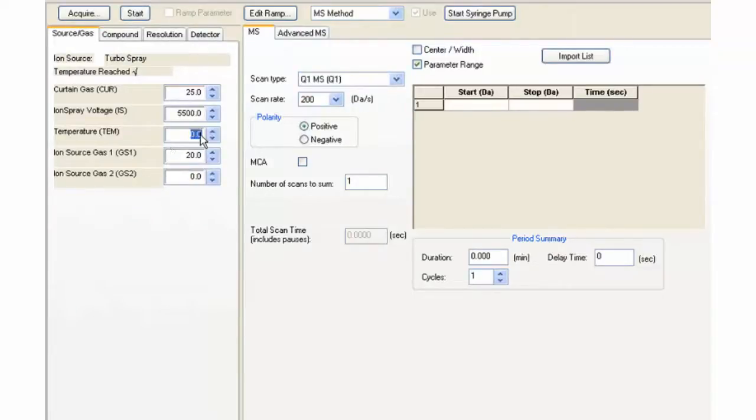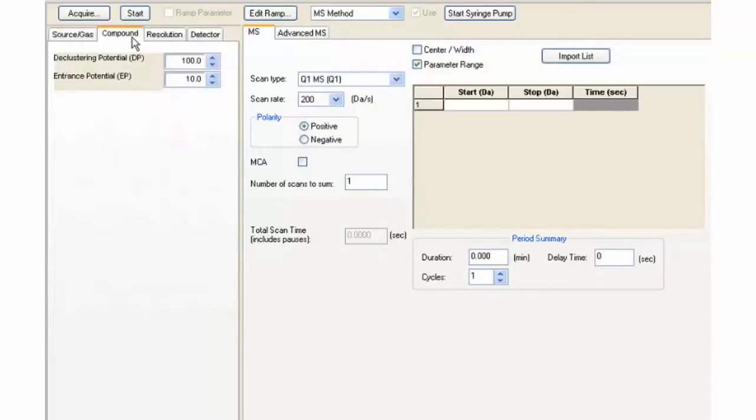Next, click on the Compound tab. Since we will be looking for PPGs, a reasonable declustering potential is needed.